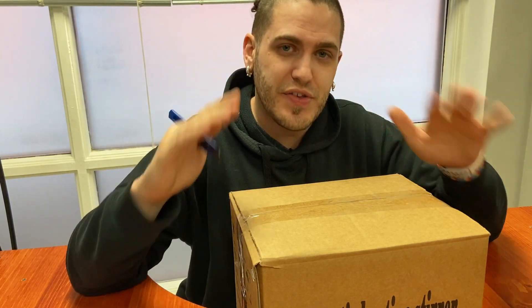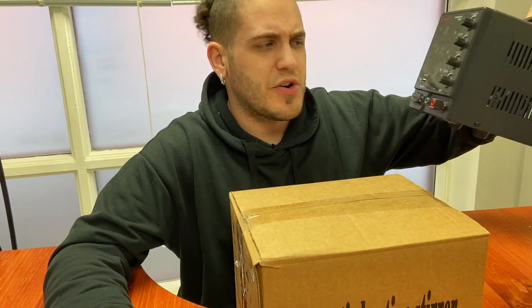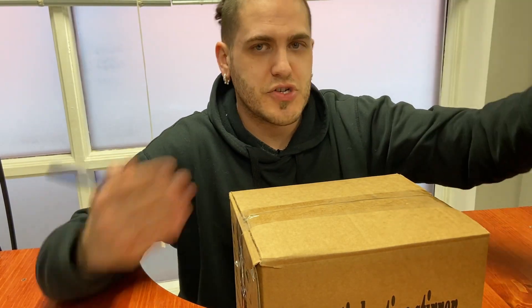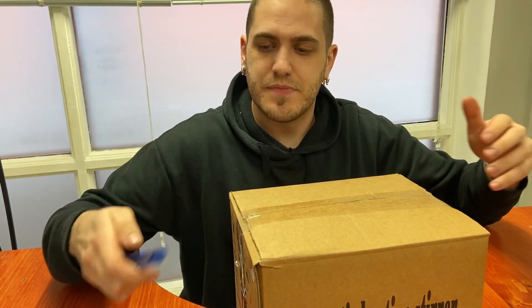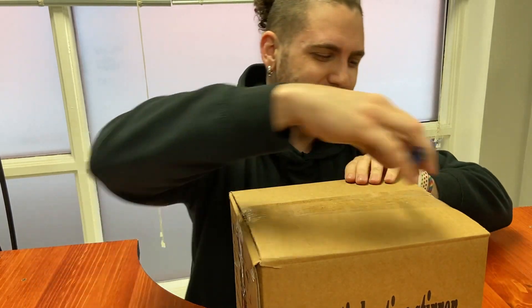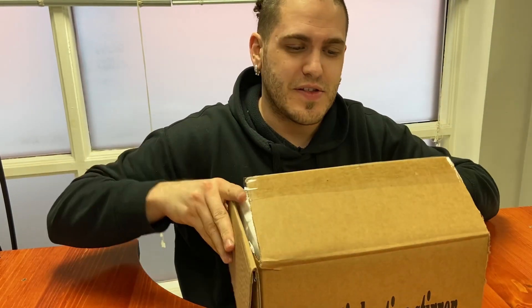I'm taking all the steps that I can. In a previous video I believe we looked into this — this is our rectifier, basically a variable DC power source. I've also got some beakers; we'll open this up in a bit and I'll show you how this works in conjunction with this tool. Full disclosure, I've already been inside this box so things aren't really organized, but it's a nice little piece of kit.